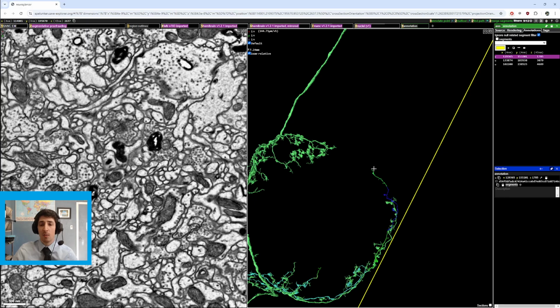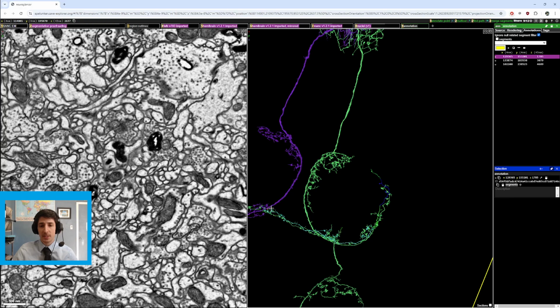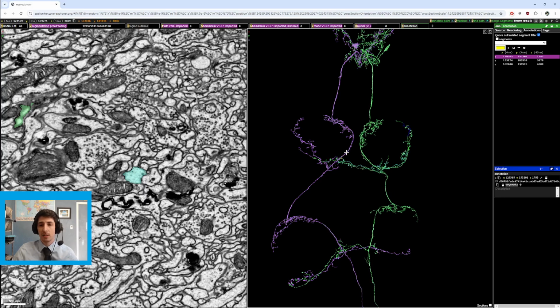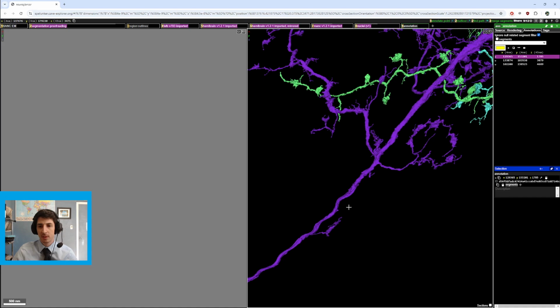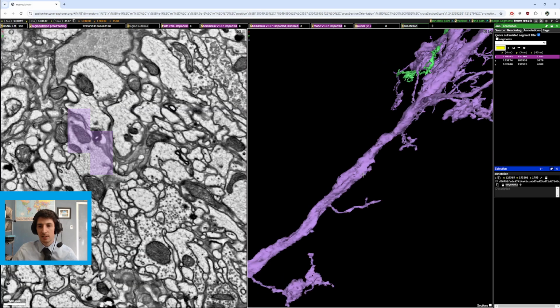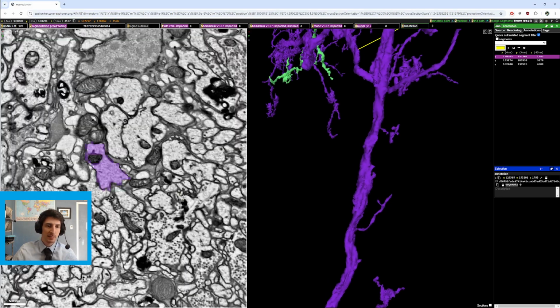So what I was looking for was the missing branch that the green one had, but the purple one didn't. So I checked in the vicinity, which I would say anywhere from like here to here, that branch could be. You know, things that stick out like this. This one's pretty thin. This one kind of looks like, if we checked here, there might be something.